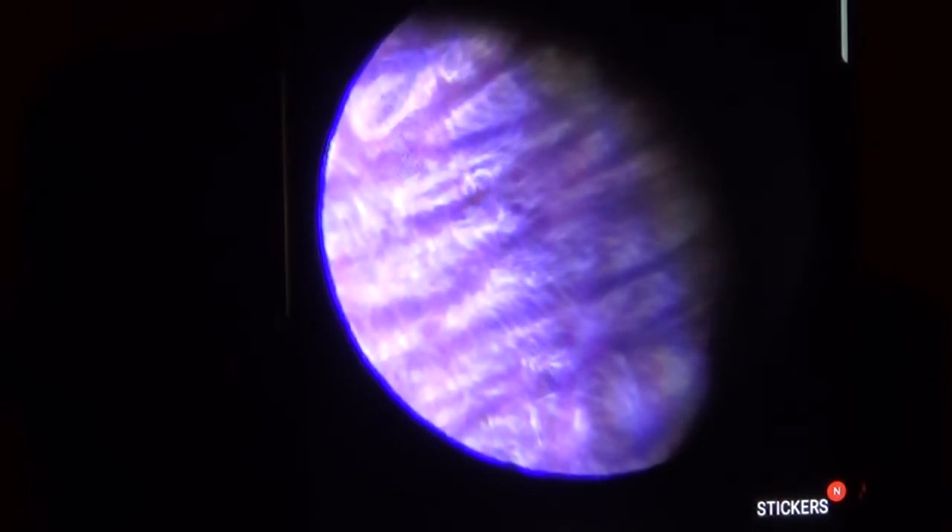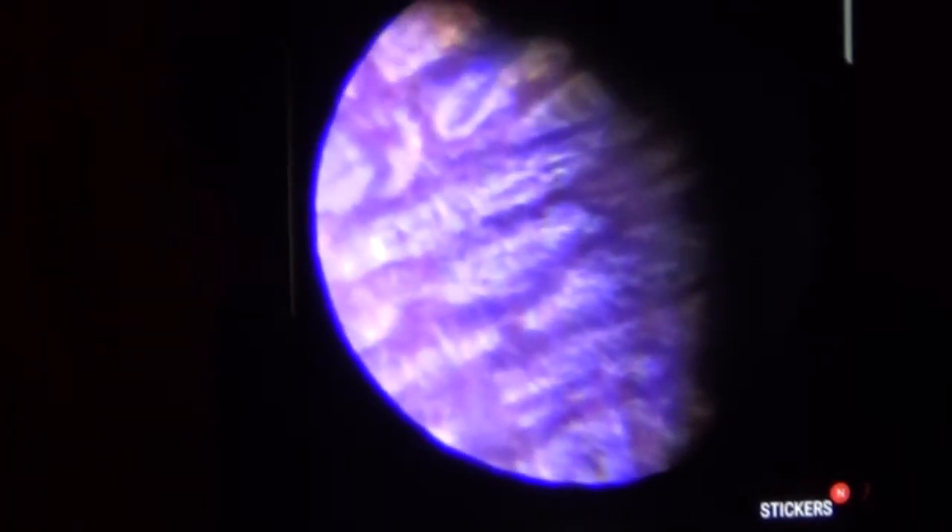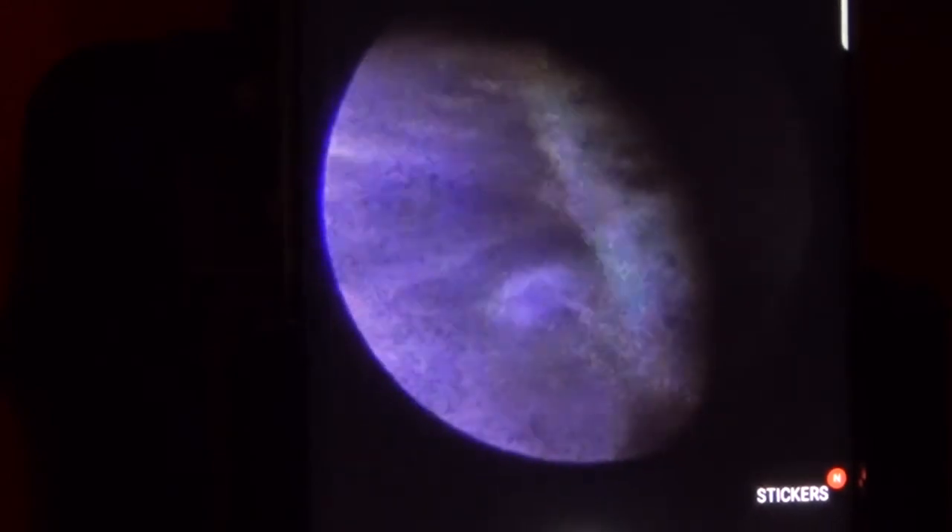This is an onion skin and I think this is on 10 times magnification. If I get out a slide — I'm probably zoomed in too close — but I'm actually going to turn the magnification up a little bit so it shows you more.